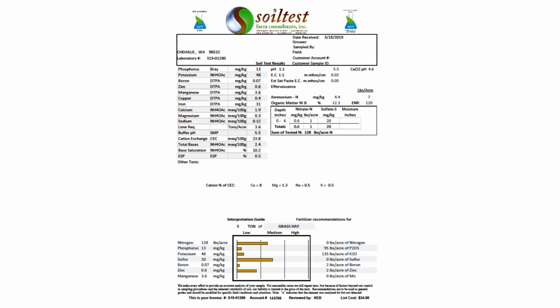We decide which extraction to use based on the customer's request, which is driven mostly by the region from which the samples come from. Eastern Washington and Oregon use an Olsen extraction. A Bray extraction is inappropriate for these areas because the phosphorus chemistry in our soils is largely dictated by associations with calcium. And adding a Bray extraction to a high pH soil will dissolve a lot of the calcium-phosphorus complexes and overestimate the availability of phosphorus. Conversely, in low pH situations, Bray is a better extractant for phosphorus.